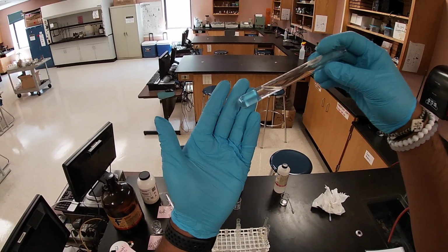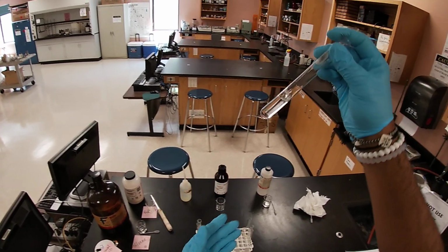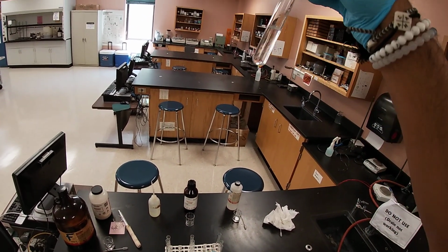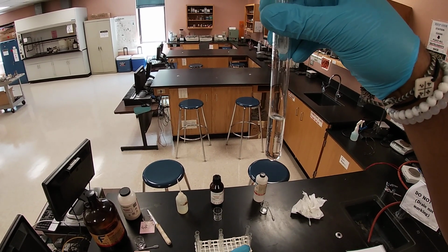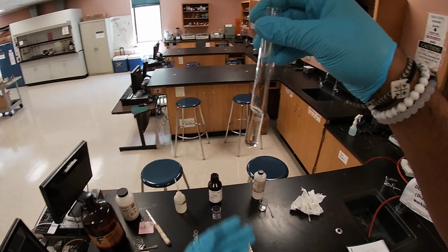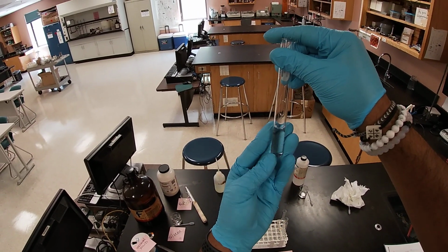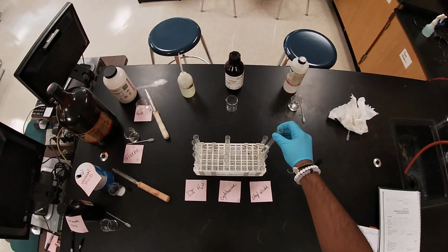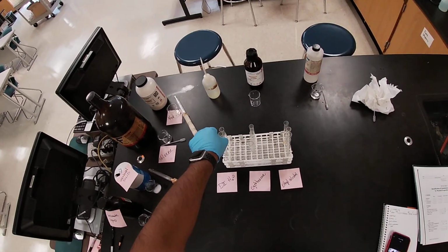Yeah, look, it feels like it doesn't want to in there, creating some sort of a, can you see it? Hopefully. Feels like it wants to, but it doesn't. There is no clear separation. There's no two layers here, so ethyl alcohol dissolves toluene. And then we go to the next one.